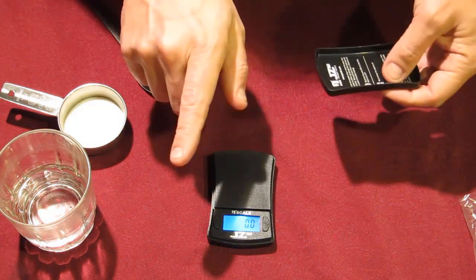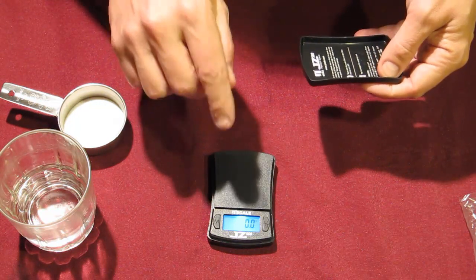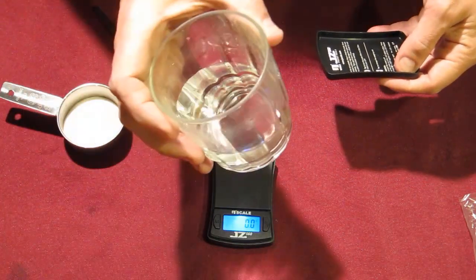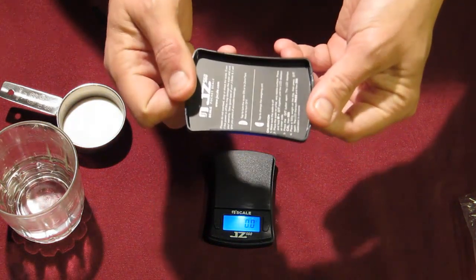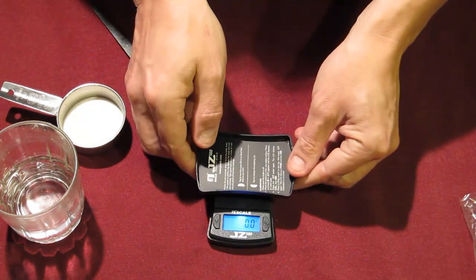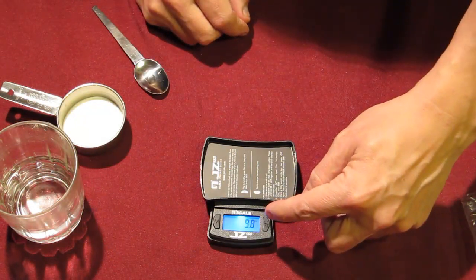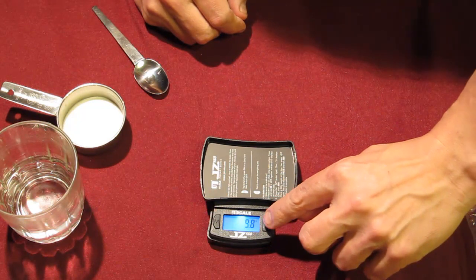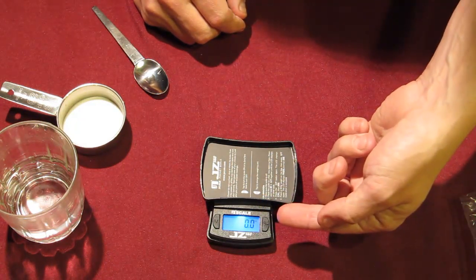Now you need to measure your DCA onto something — don't put it directly on the scale, it'll get too messy. Also, the scale can only handle up to 560 grams of weight, so don't use something like a coffee cup or a glass drinking cup to measure your DCA in. I recommend you use the tray that comes with it. Simply set the tray on top of the scale — you'll see the numbers change, it goes up to about 10 grams.